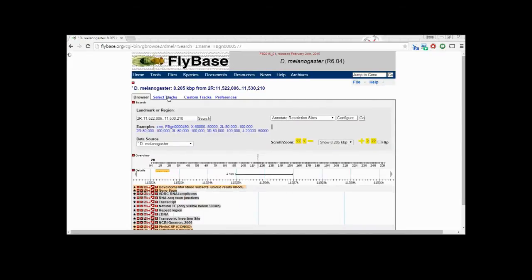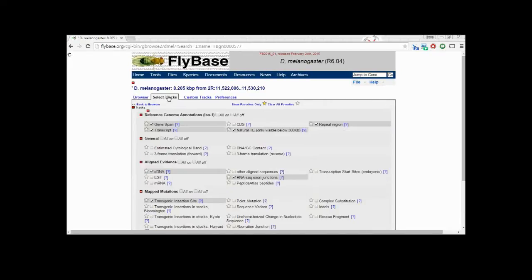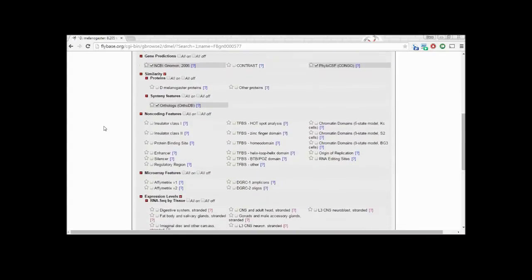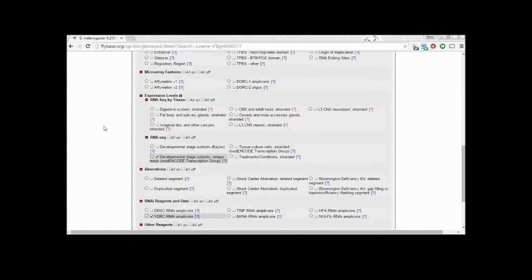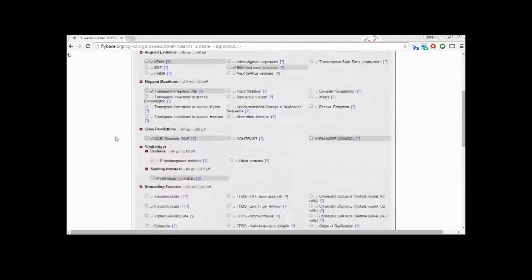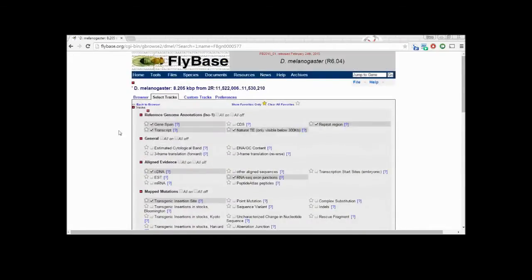To customize our view, we click select tracks. For our purposes, we want to go to the expression levels and select all tissue types. This will show when the gene is transcribed. We also want to make sure the developmental stage subset option is selected.